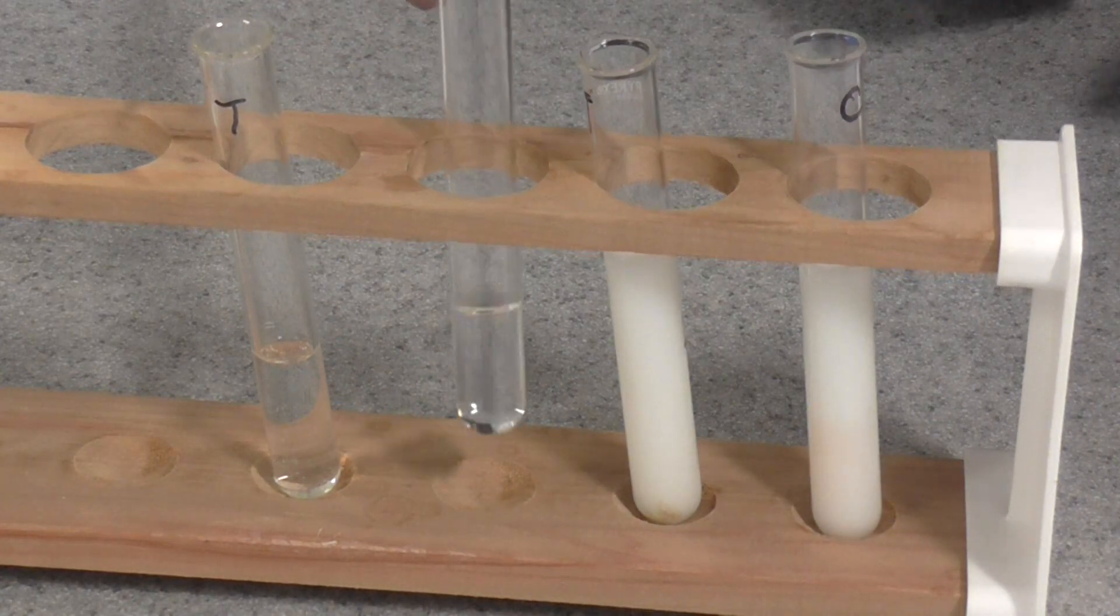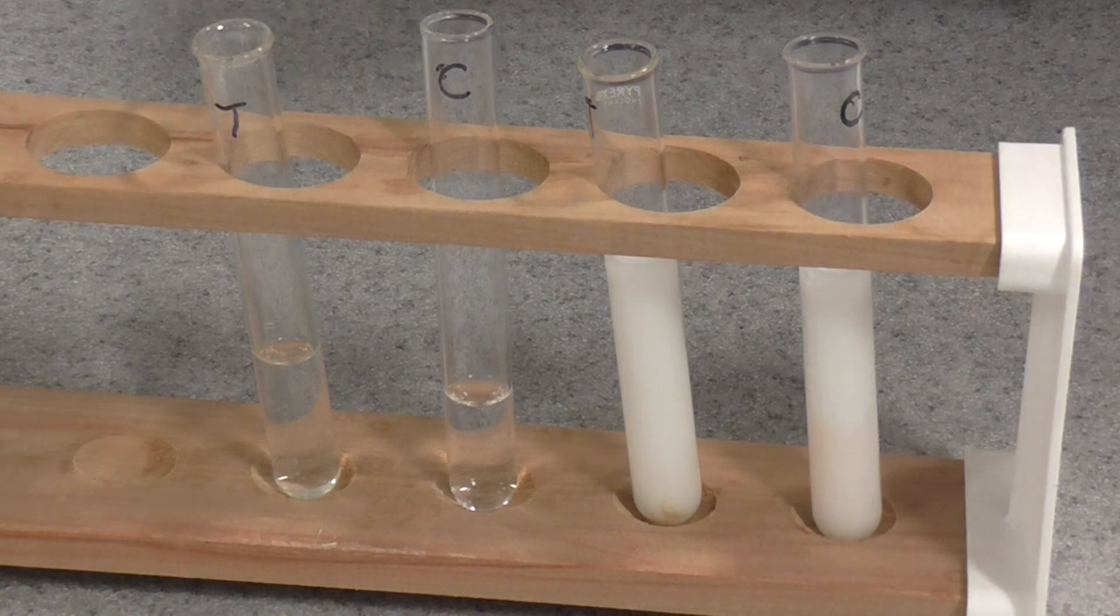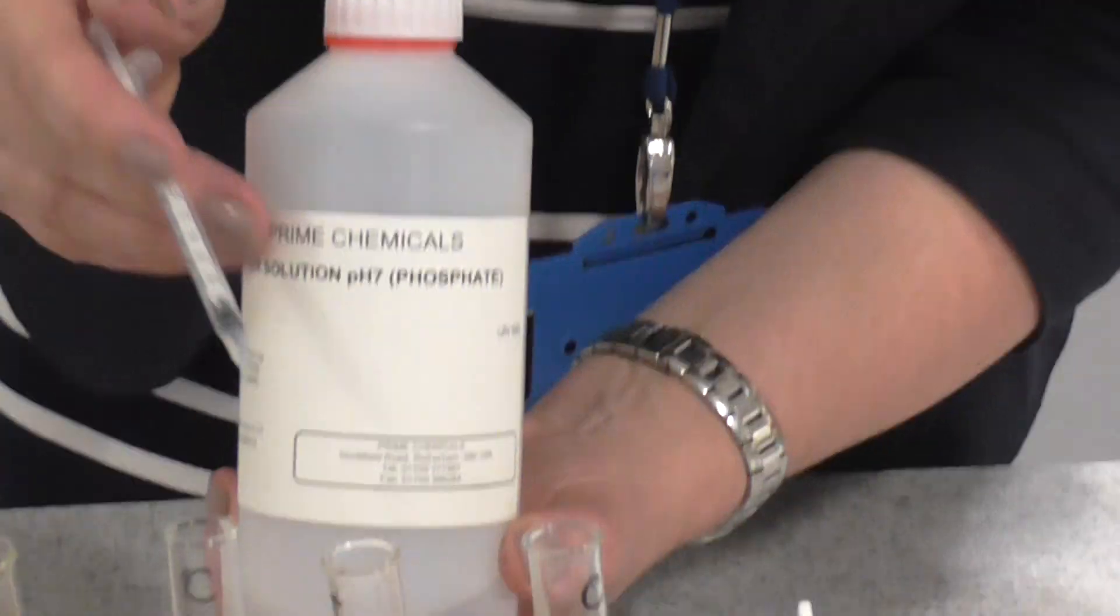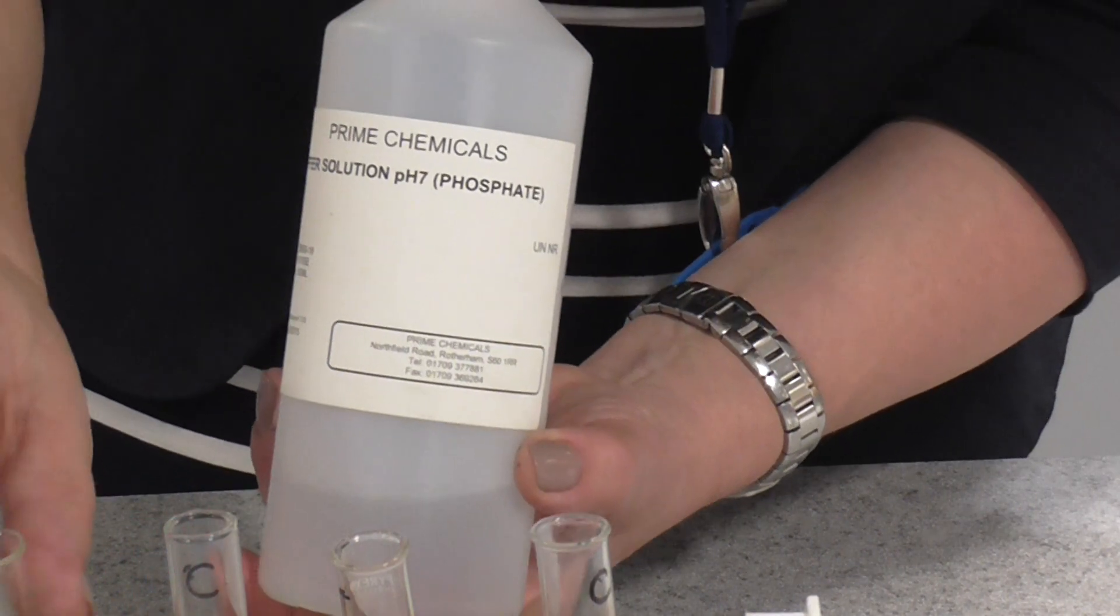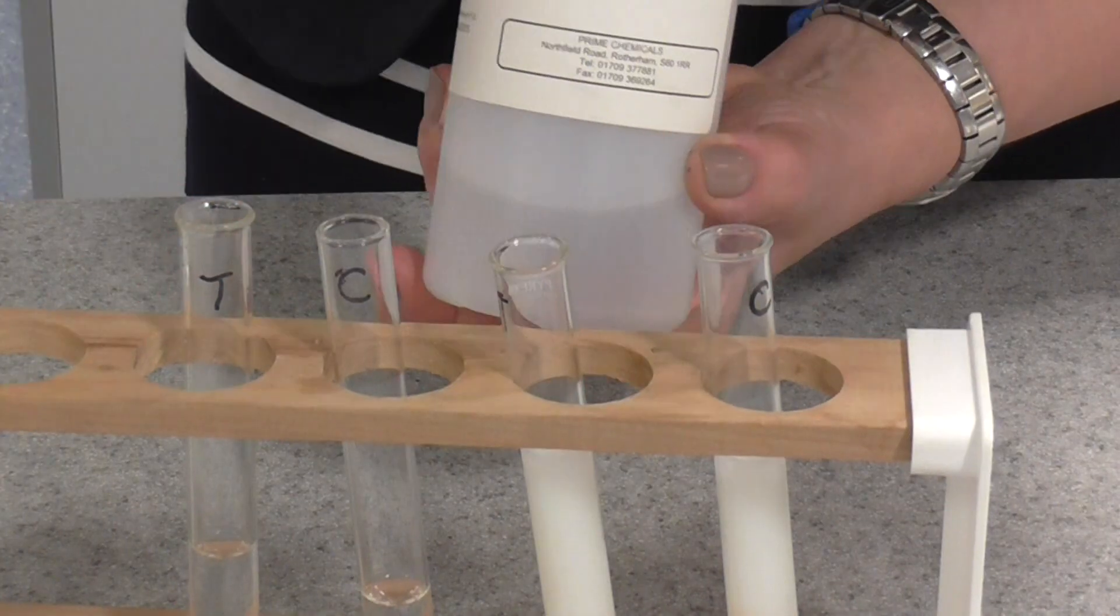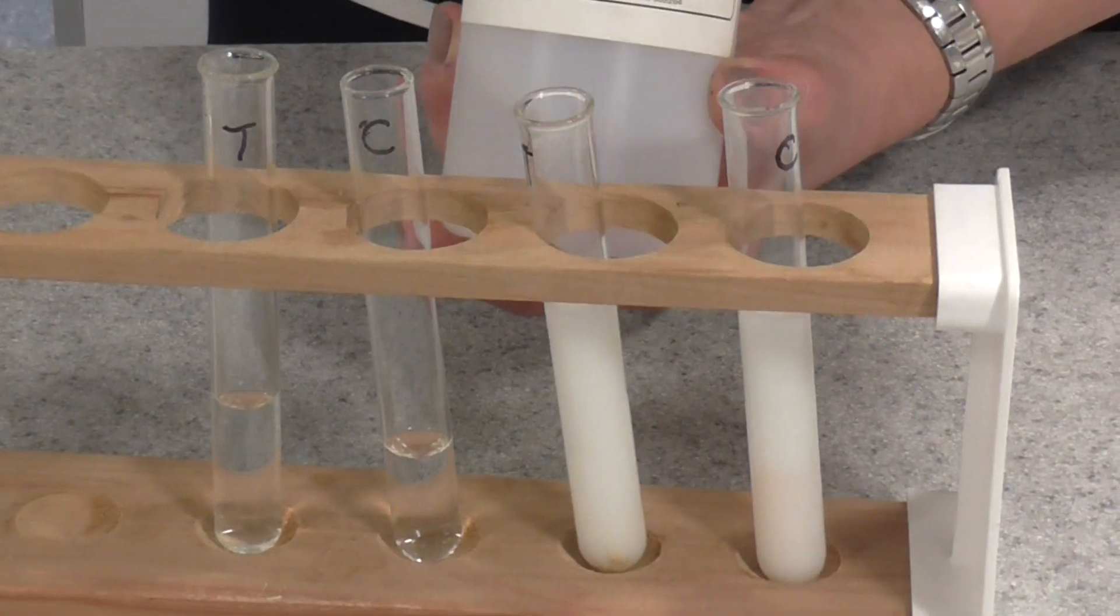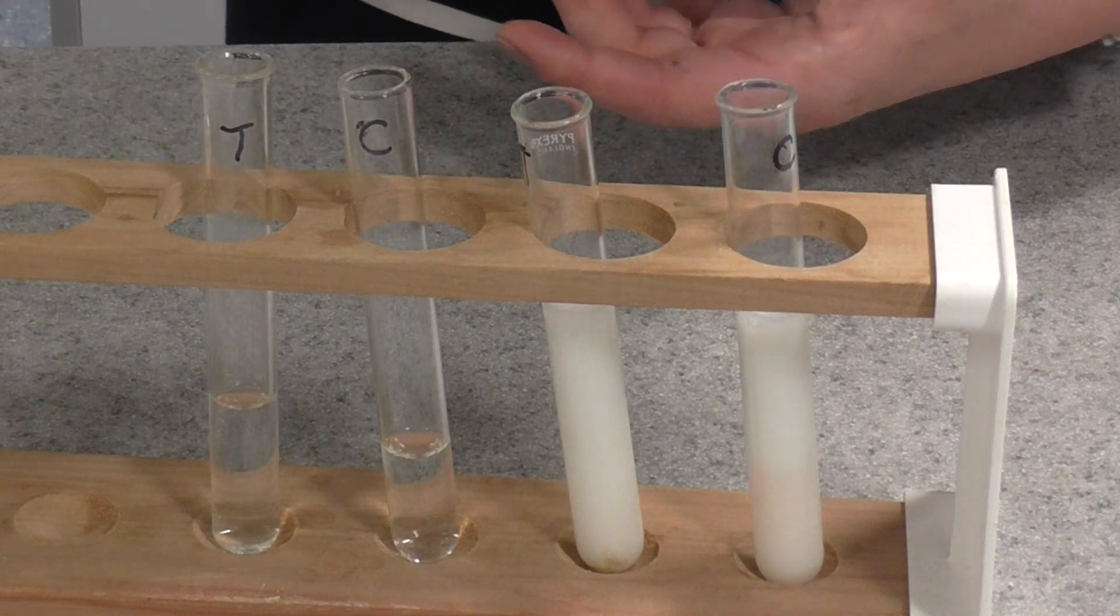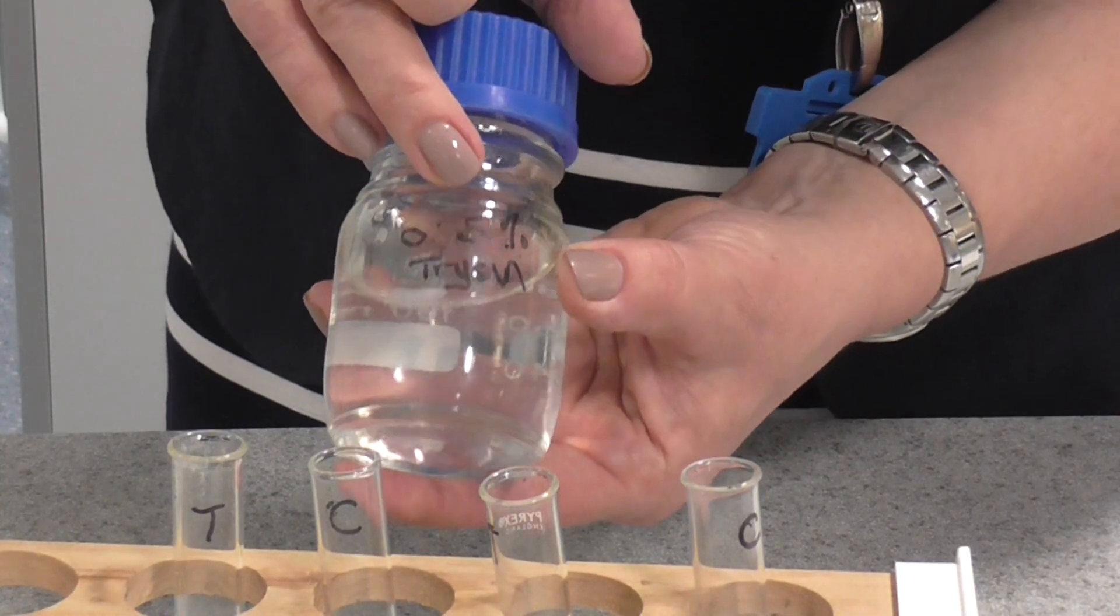In this tube here, this is for the control, I've got 4 centimetres cubed of pH 7 buffer. I've used a smaller syringe there, and I've just got 4 centimetres cubed of pH 7 buffer. In the tube labelled T here, I've got 2 centimetres cubed of pH 7 buffer, and I've also added to it 2 centimetres cubed of 0.5% trypsin solution.